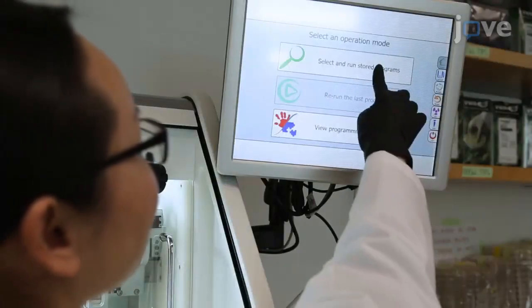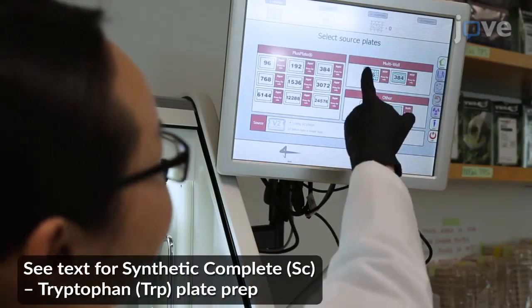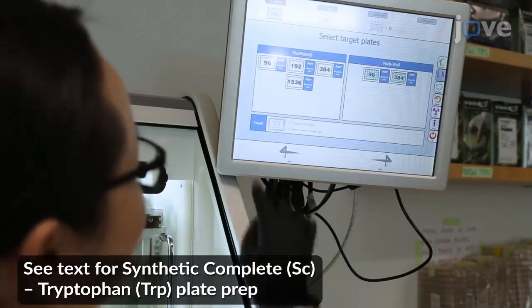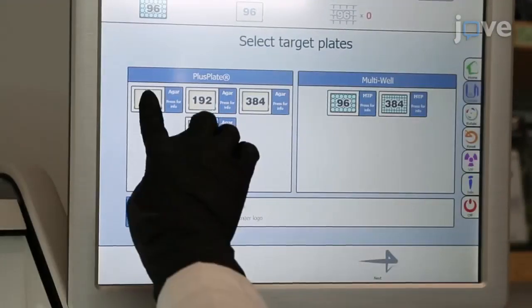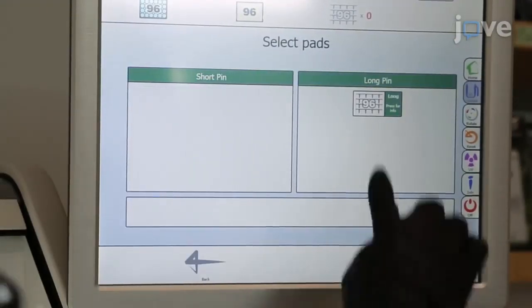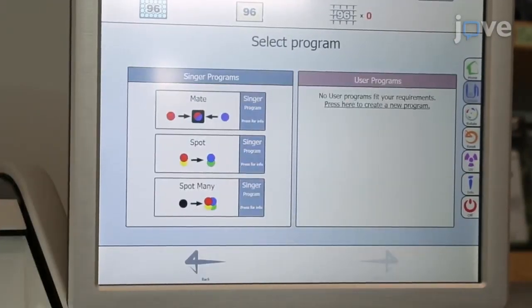To spot the yeast into SC-tryptophan rectangular plates, use a high-density array robot to select multi-well 96 plates as the source, 96 auger plates as the target, and 96 long pin pads. Pin pads are not reusable and should be discarded.